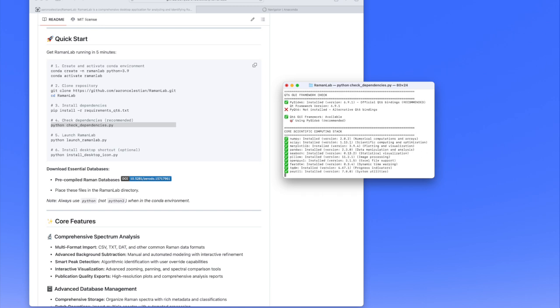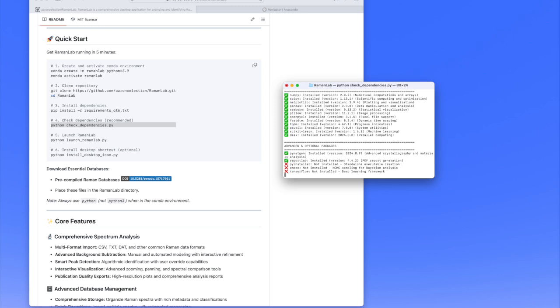Pandas store databases as pickles, PKL files, and you'll see that a lot. And PyInstaller, standalone executable creation, I tried doing that, but it's just a pain. So let's not do that.